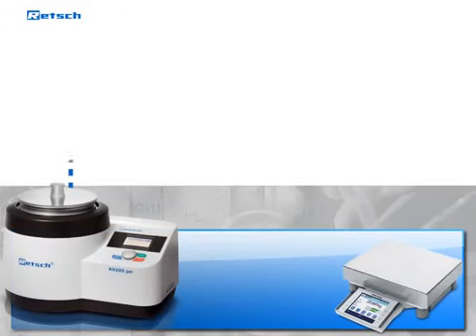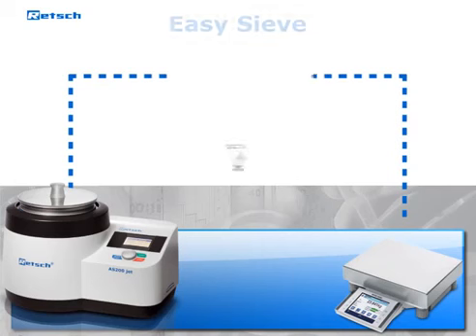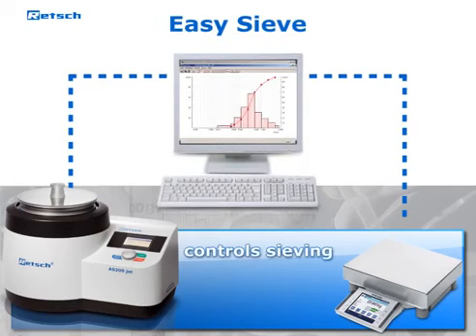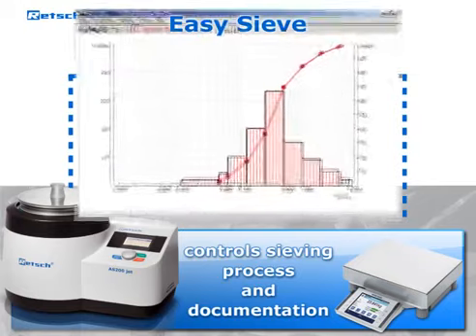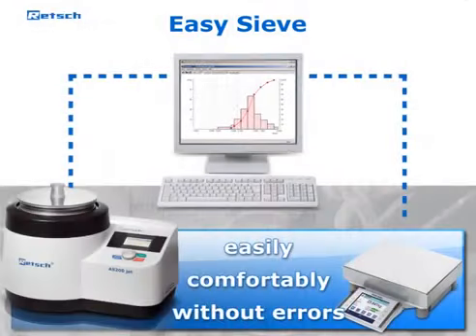Thanks to an integrated interface, the AS200Jet can be controlled with the evaluation software EasySieV. This program allows control of the entire sieving process and the subsequent documentation, easily, comfortably, and without errors.